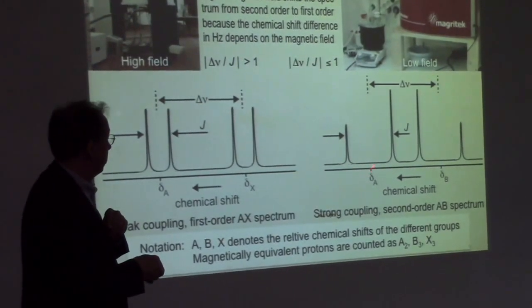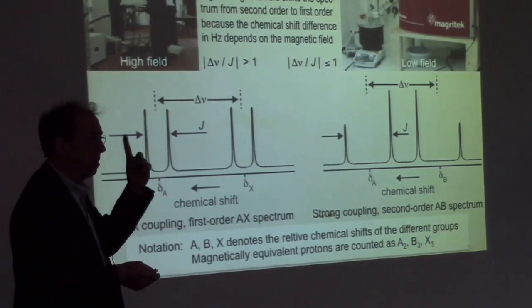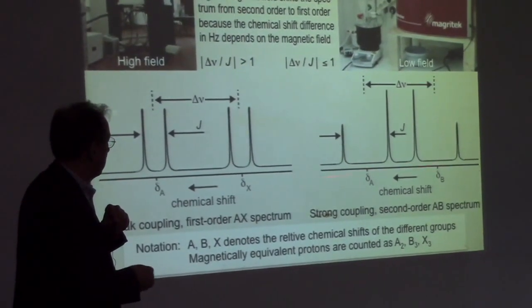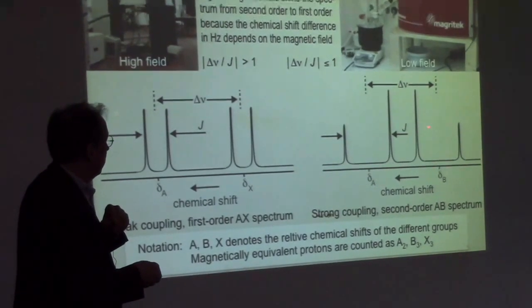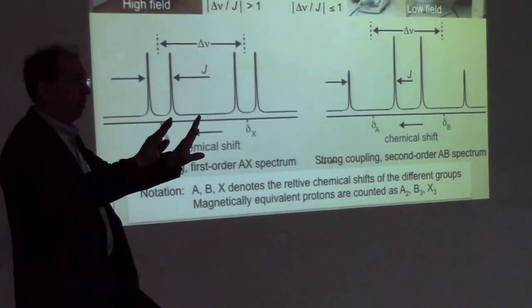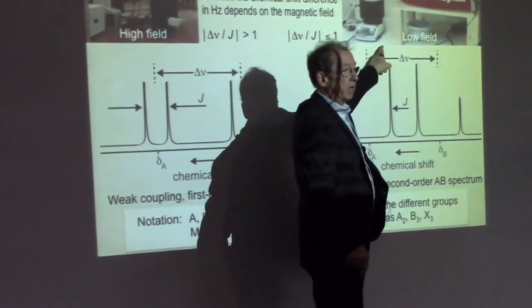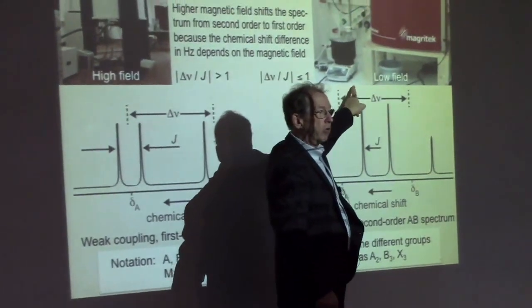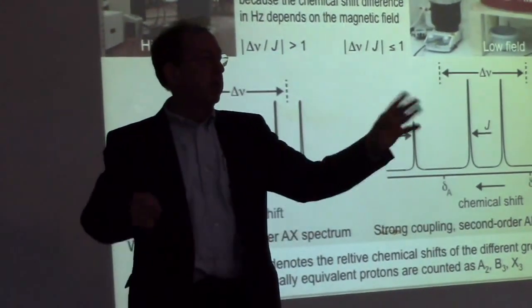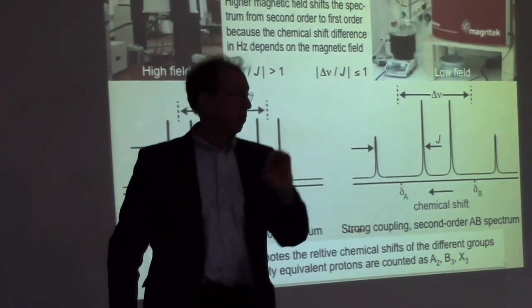So you have one chemical shift here, you have that doublet, which was this doublet, different magnification. That's my mistake, I should change it. And so a different stretch of the chemical shifts there. And the other line splitting is over here, and if they move even closer together, then these lines go even smaller and they get even higher. And you get distortion, and you may mistakenly say, oh, it looks like a quartet, my analysis is done, if one doesn't take care of the fact that you have a roof effect.